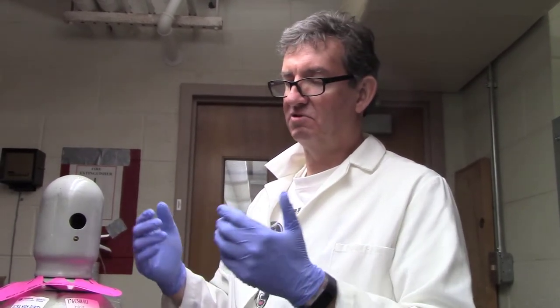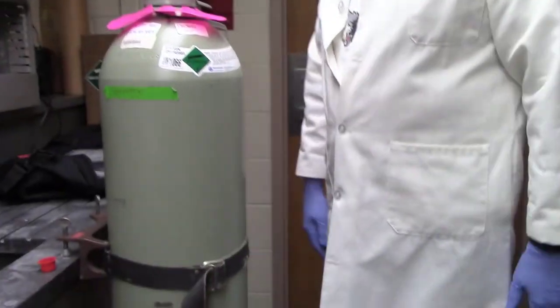So two things in order to try to keep yourself safe when using gas cylinders are to make sure it's capped, particularly when it's being moved, and also when you receive a tank, to strap it in so it does not fall over and present the dangers.